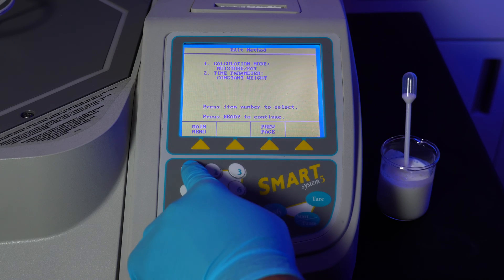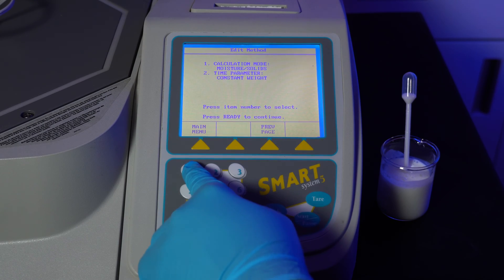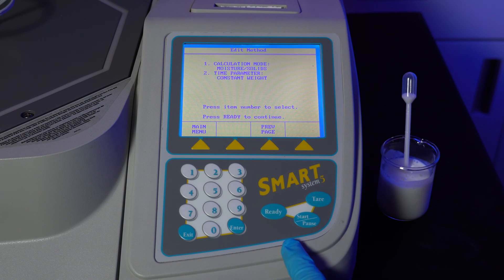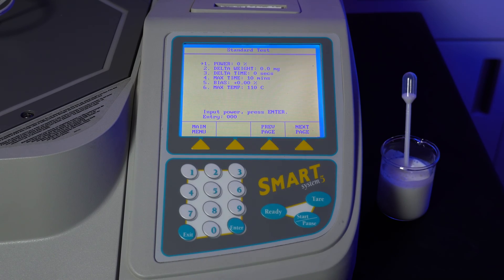Press 1 to select the calculation menu. We'll be choosing moisture or solids. Press 2 to choose the time parameter — we'll be choosing constant weight. Hit ready when done. We'll be using a standard test, hit 1. On this menu, you'll have to first hit the number corresponding to the setting you want to change. Hit 1 and then type 100 to indicate 100% power. Hit enter when done.